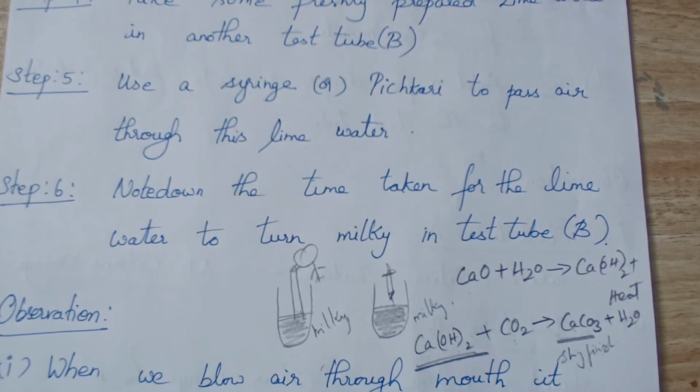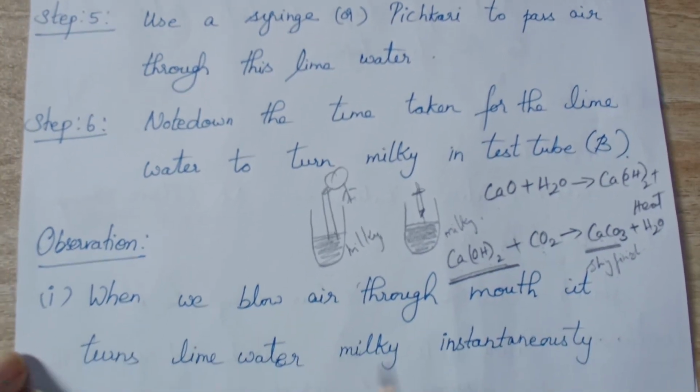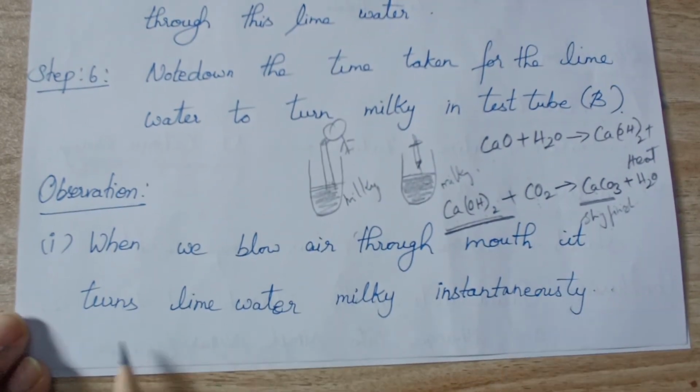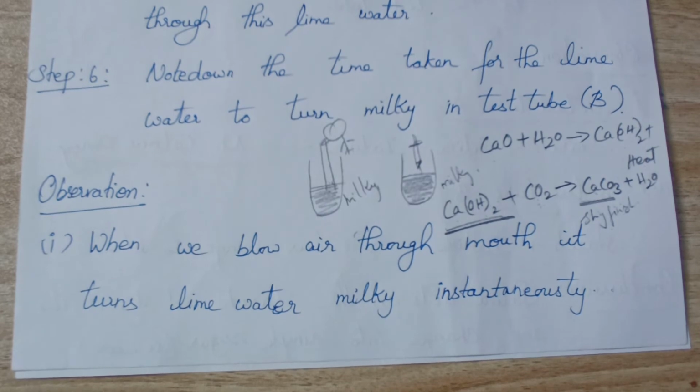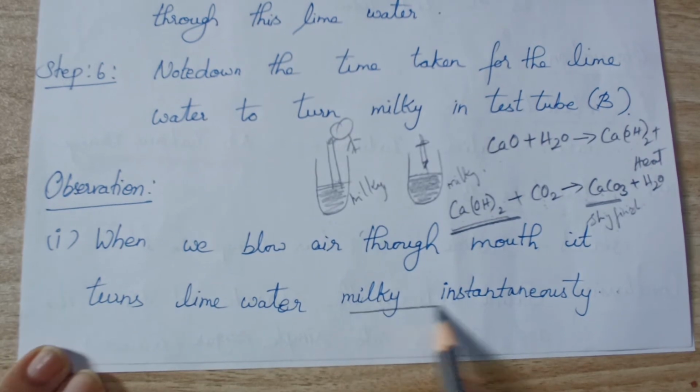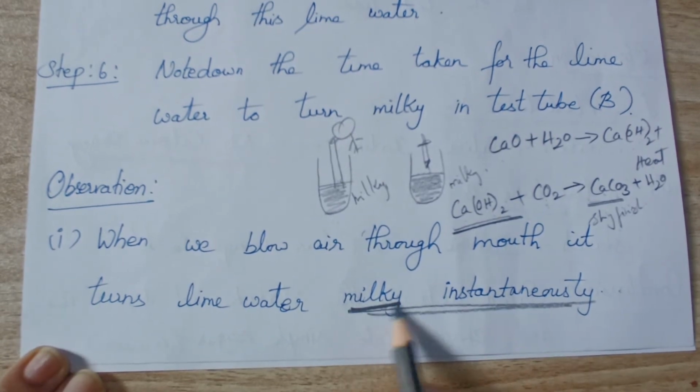What is your observation? When we blow air through the mouth, it turns lime water milky instantaneously. Once you blow the air into the lime water, instantly it will turn milky.